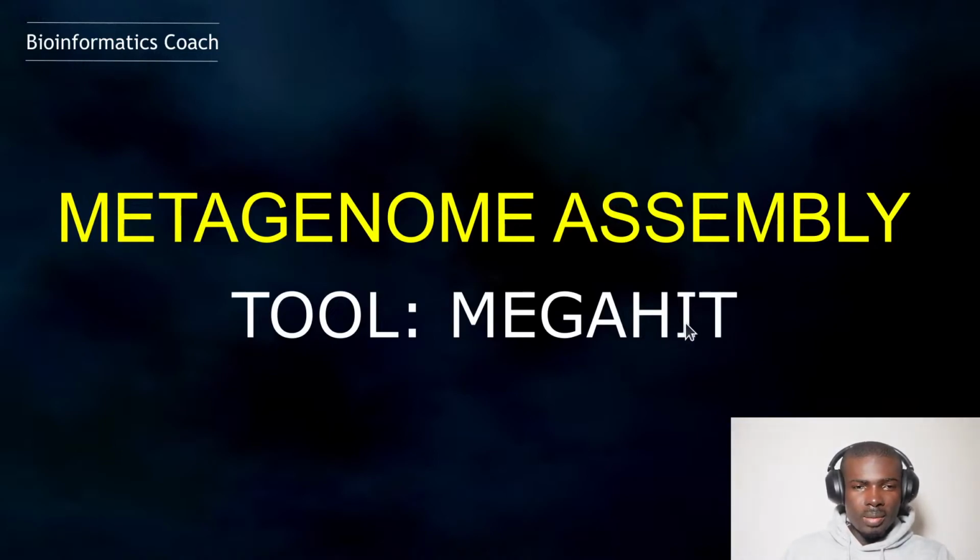Hi everyone, welcome back to the Bioinformatics Coach channel. In today's video, I'm going to show you how you can assemble metagenomic data using Megahit. So that's what we are going to do next.